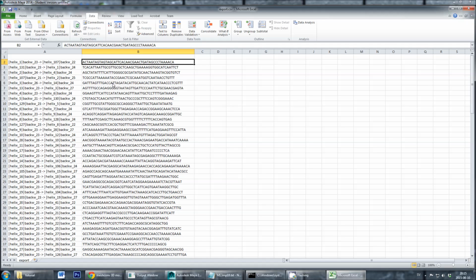Okay, we have now gone through the production pathway from a polyhedral mesh to a finished DNA nanostructure design. And in the next tutorial I will go more into depth about the design of staples and the other features of vHelix when designing a DNA structure from a polyhedral mesh.